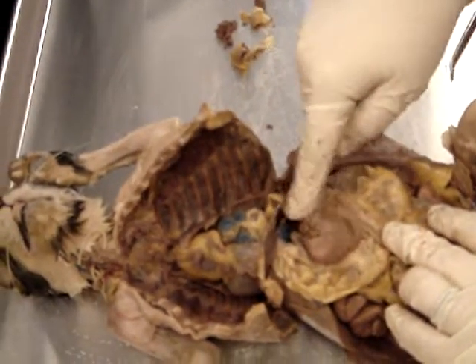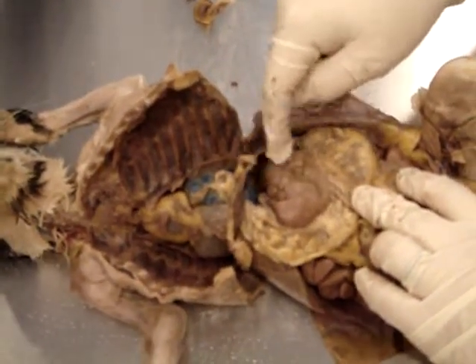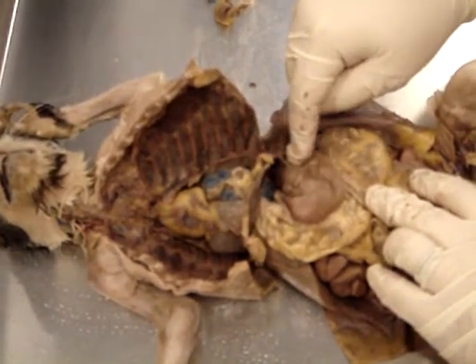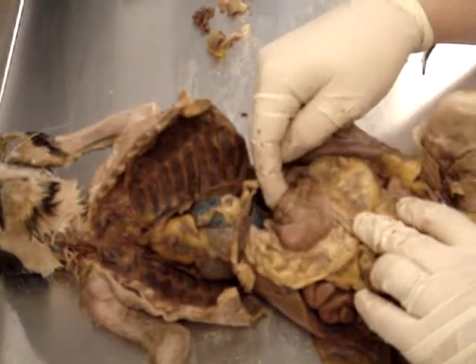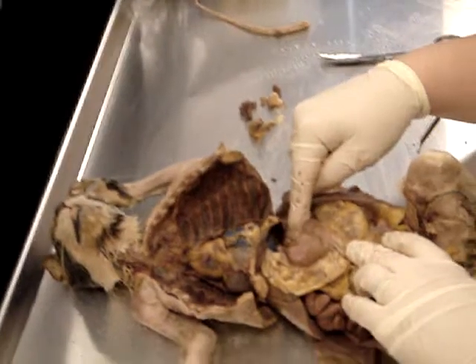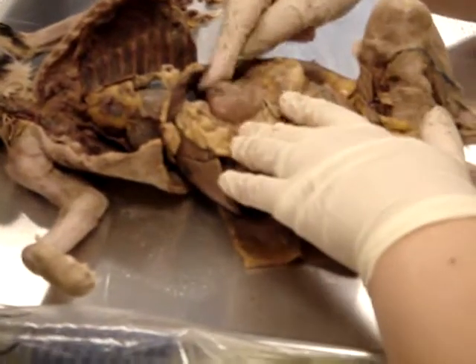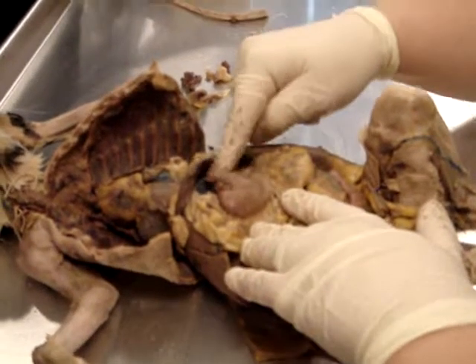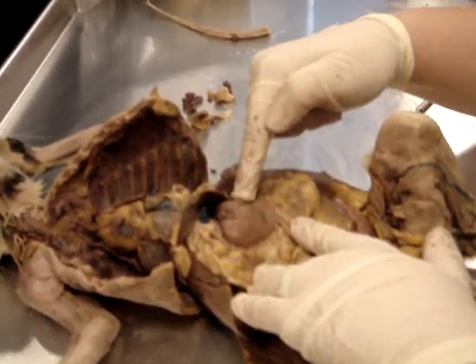All right. The top third or so of the stomach is called the cardiac region. And cardiac means not cardiac muscle, cardiac means heart. So when you have heartburn, what's actually hurting is the connection between your esophagus and the cardiac region of your stomach, okay? It doesn't have anything to do with your heart, but it feels like it's in your chest, so that's why they call it heartburn. So the fundus is the curve on the top, and then the cardiac region is like the top third of the stomach, okay? Then we have the body of the stomach, which is like the middle third.